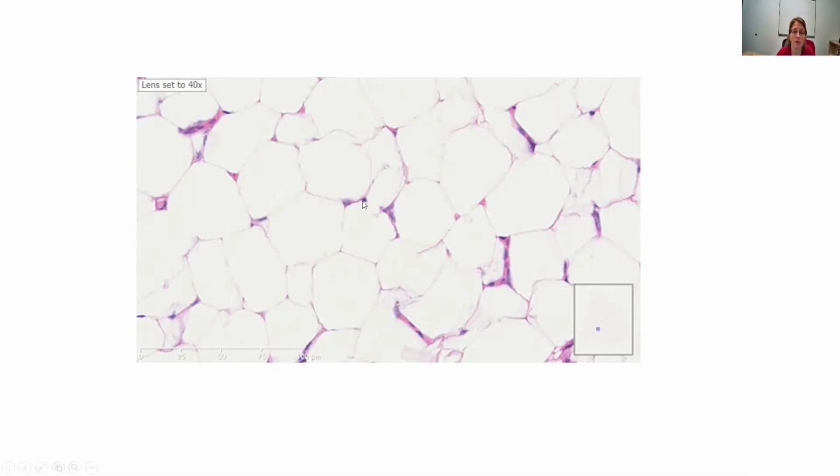So even if you get liposuction and you remove some of these cells, the ones that are left can just keep growing. It looks kind of balloon-like, and the adipose inside the cells pushes the nuclei off to the side. So this is where you've got 4 or 5 adipose cells all bunched in together, and all of their nuclei just happen to be right next to each other. But these big rings and bubbles, it's adipose tissue, which is a connective type of tissue.